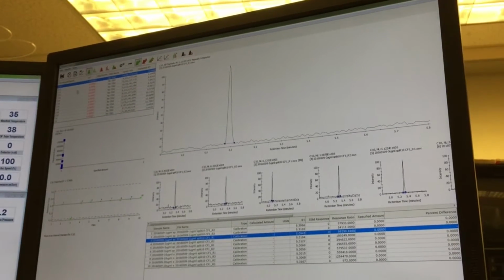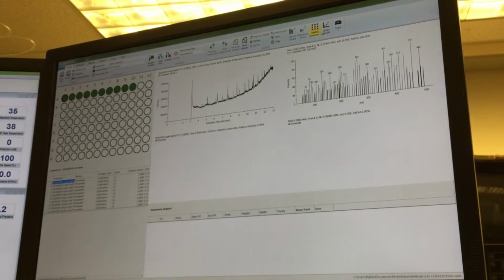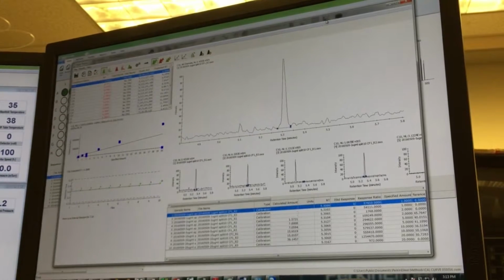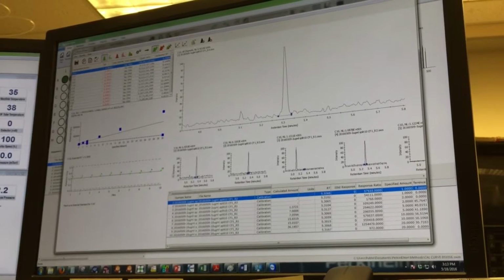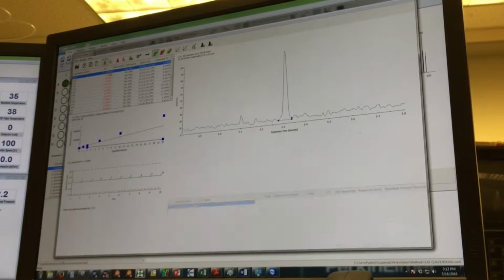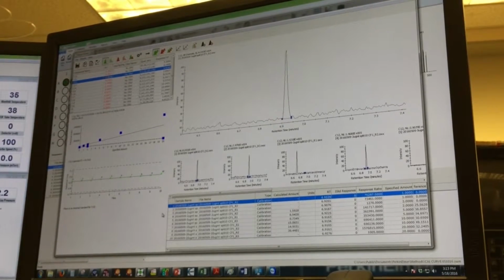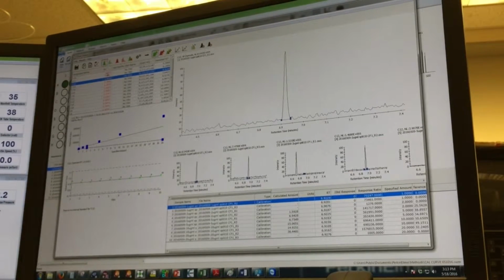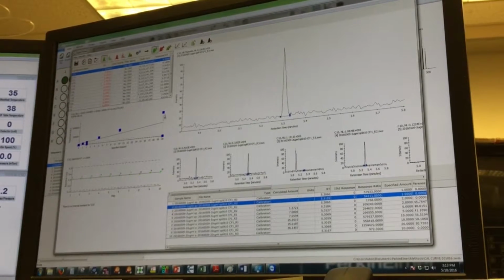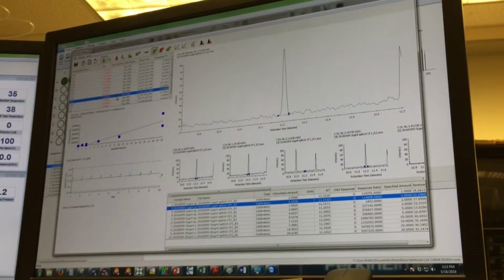If you have opened the quant viewer, close that, otherwise it will not show. You have to show it, then you can see the quant result. Then after processing, click on quant result. Now you have this, but here you see something very strange. You can modify this. Okay, now you see the R-square value is very low, because you see here it's a huge gap, so something is wrong at this point. Choose 19 and 20.